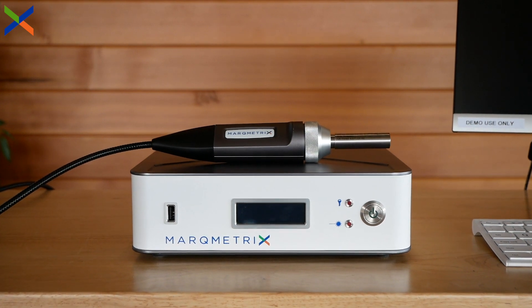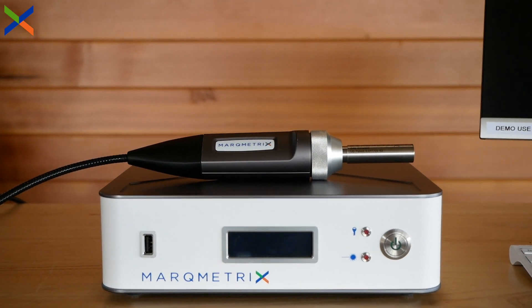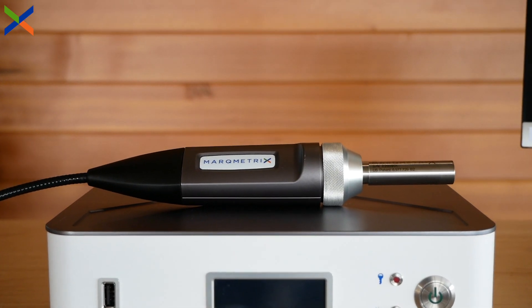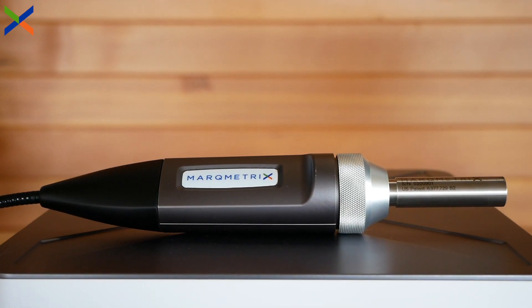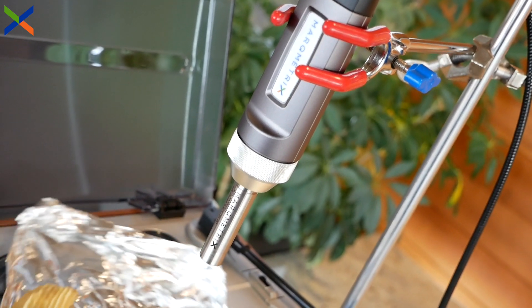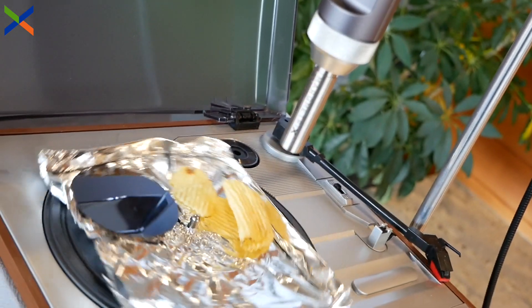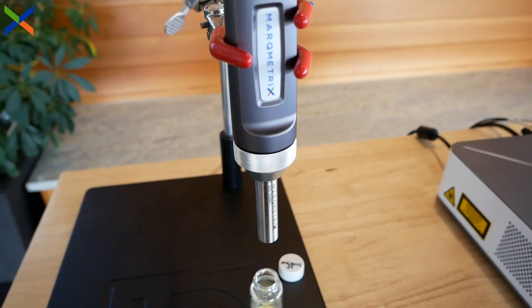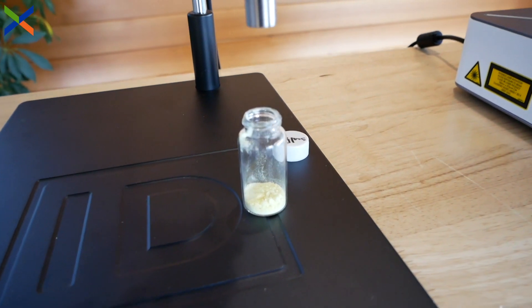Here are the specs for Proximal Ball Probe HV. HV is even more compact than Proximal Ball Probe, with just 3 inches of overall length. Despite its smaller size, HV has a working distance of 100mm and a beam spot size of 3.5mm. As a result, this probe offers distinct advantages in its ability to take rapid measurements of in-motion samples on conveyor belts or rotating drums from a significant distance, as well as samples with uneven packaging or those that vary in height, like these potato chips. The large beam spot allows HV to sample a large surface area, effectively averaging the analyte during sampling.